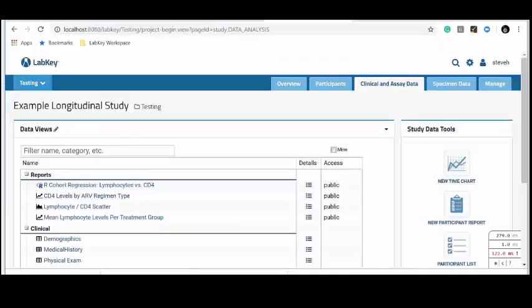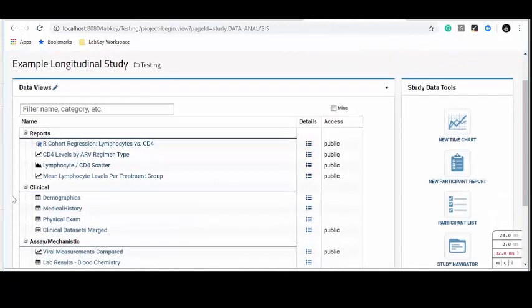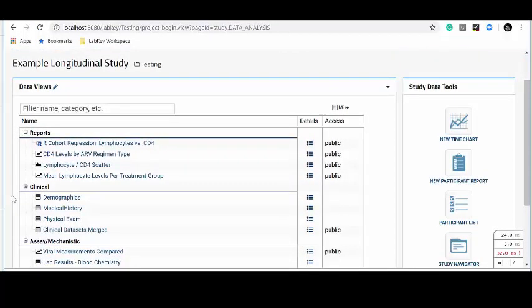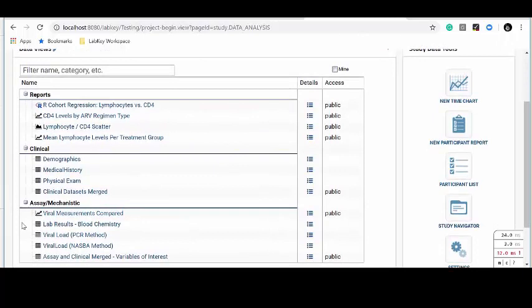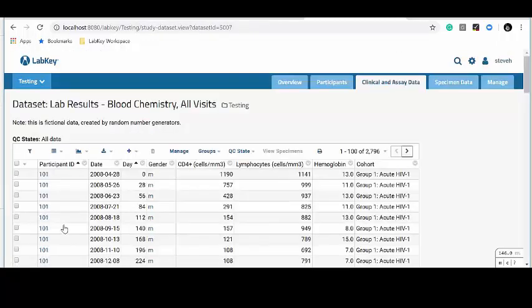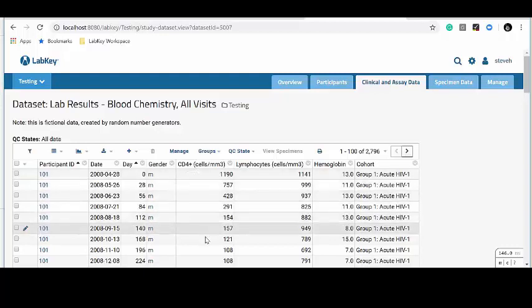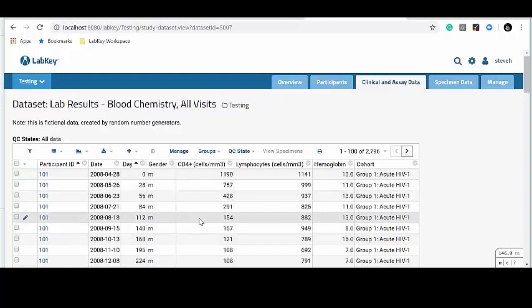Let's actually take a look at the data I've prepared inside of LabKey Server so we can get a sense of what we're going to be visualizing. Here is a fictional research study that I've created inside of LabKey Server. This is all data I just invented with number generators, but it's meant to be realistic and to reflect real events in HIV research. I've collected a number of different tables of data, notably some blood chemistry data. One of the key metrics in HIV research is the CD4 levels of a patient — CD4 is a kind of white blood cell that's attacked by the HIV virus, so this metric tells you a lot about the health of your patients and their disease progression.